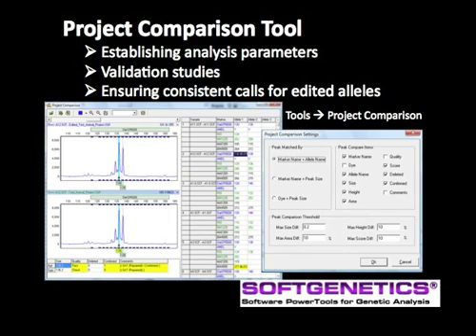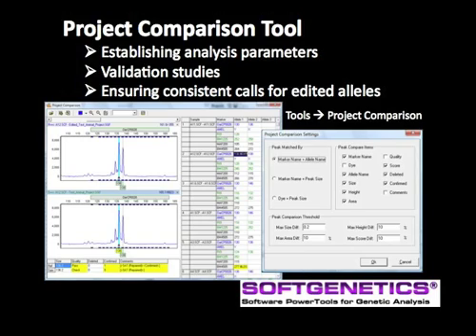Project Comparison is especially beneficial for long-term projects to confirm that edits and comments are consistently applied. The two projects are compared using some or all of the options in the Project Comparison Settings box. If there are no differences in the same sample for the two projects, the table is not highlighted. Any peak with a difference in the selected parameters will have a highlighted cell.